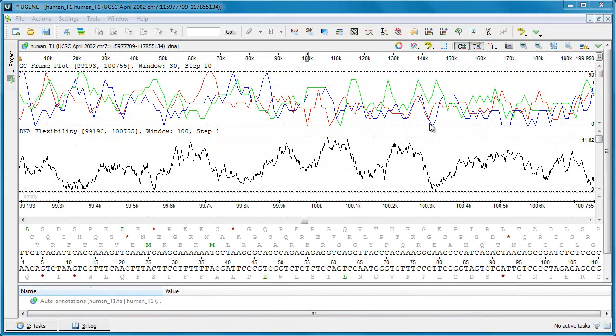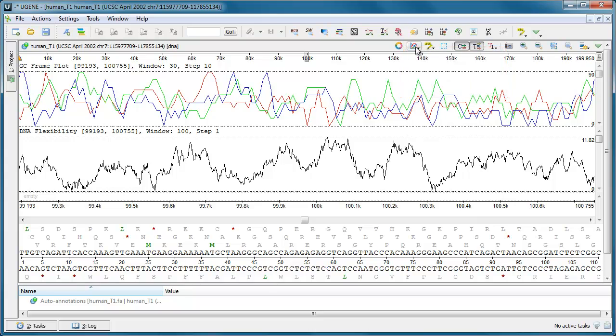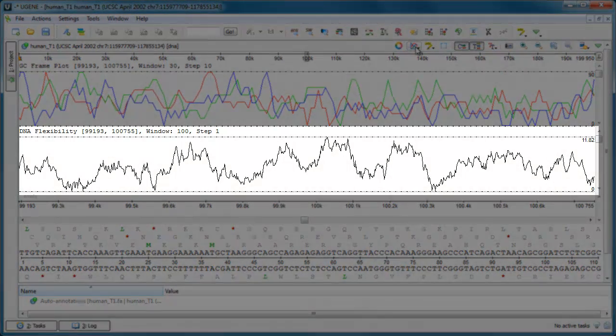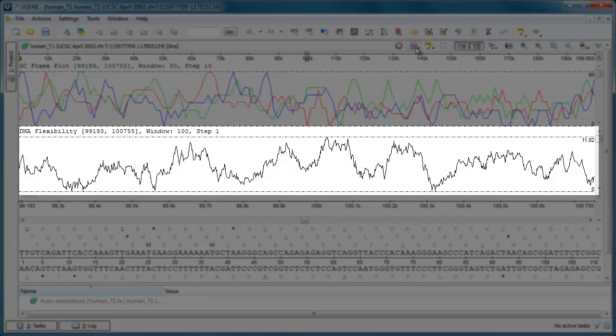The Sequence view was extended with two new graphs, the DNA Flexibility Graph and the GC Frame Plot Graph. The first one reflects the torsional flexibility of a DNA sequence, which is based on the twist angle between adjacent base pairs.